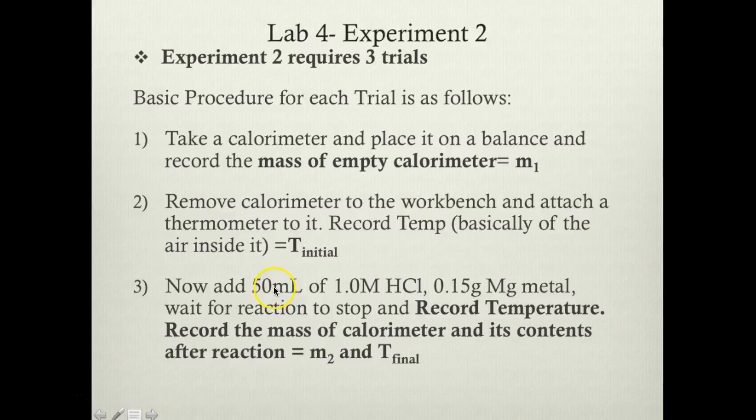And then you're going to add 50 mils of 1 molar hydrochloric acid. This is a solution, basically a combination of HCl and water, and molar is the strength.